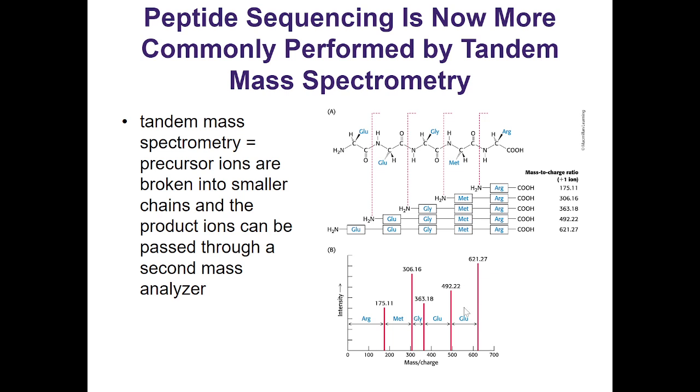What you'll see here is that literally each of these peaks here will correspond to losing one amino acid, right? Okay. And so you get peaks. Each one will be a different amino acid loss. Each amino acid has a slightly different molecular weight, doesn't it? And so you can tell which one has come off. Pretty nice, right?